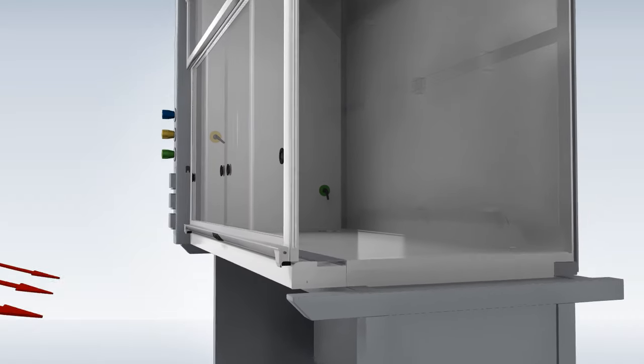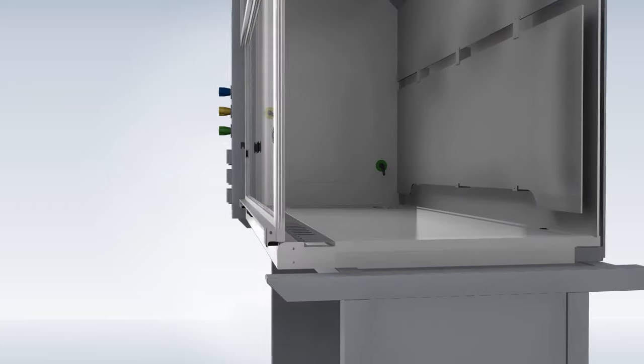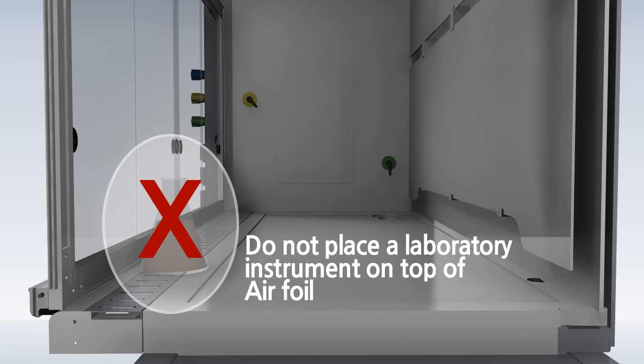The airfoil is designed to be on the same level with the work surface, and this design makes it easy to install and remove laboratory instruments. Still, it must be noted that laboratory instruments, such as reagents, cannot be placed on the top of the airfoil.